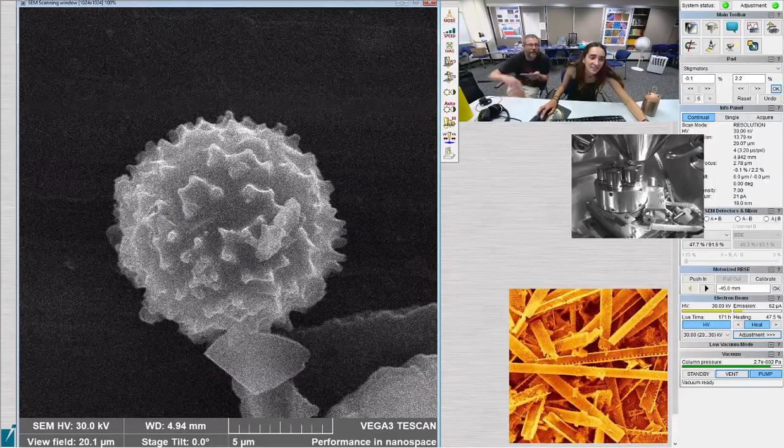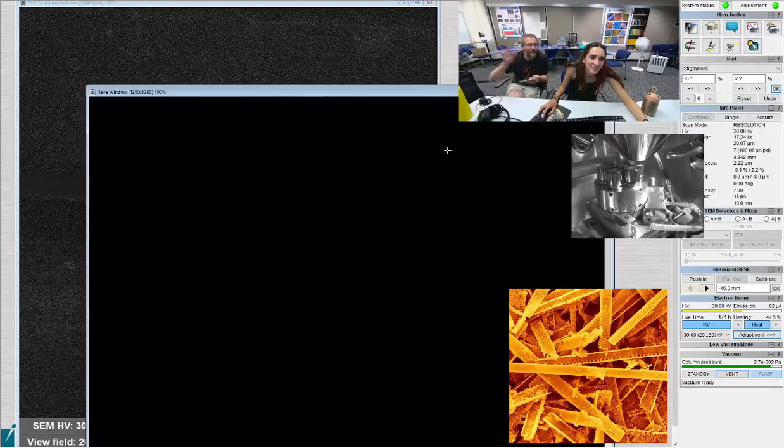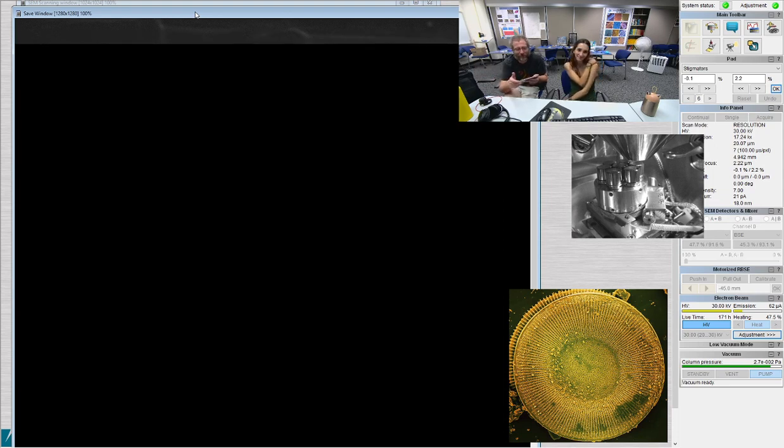I bet this is probably the first time anybody's ever seen this chrysophyte in a scanning electron microscope. I bet nobody's ever even looked at the chrysophytes. There you go. I mean, the modern ones we just have numbers for, and then the old fossil ones. Nobody even knows what that is, probably.